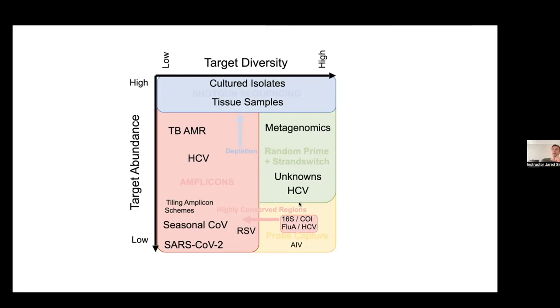So I think it's less dependent on the type of sample than the abundance of the sample. If you have something that's in very, very high abundance, you typically can extract DNA and then you get a good quality genome out. There are definitely different bacteria that are harder to extract DNA from, or they have really high AT or GC content, where the analysis and the sequencing becomes more tricky. But at least for this topic, where we're talking about sequencing viral genomes from clinical samples, it's more the abundance of the target that's important. I hope that answered your question.